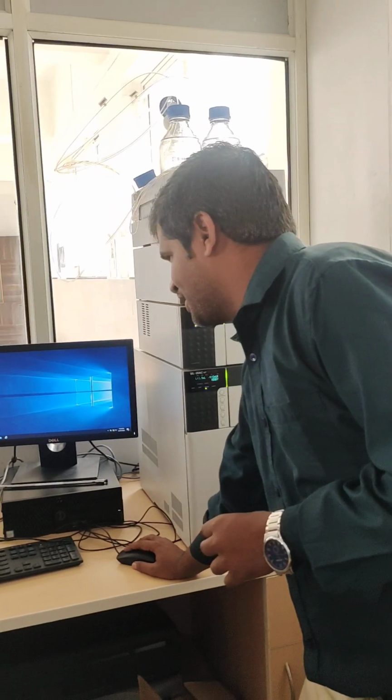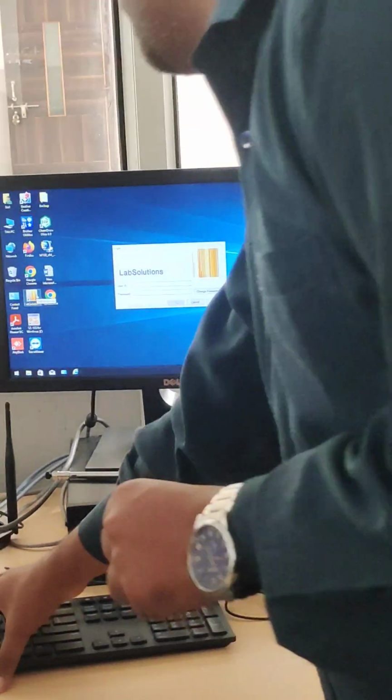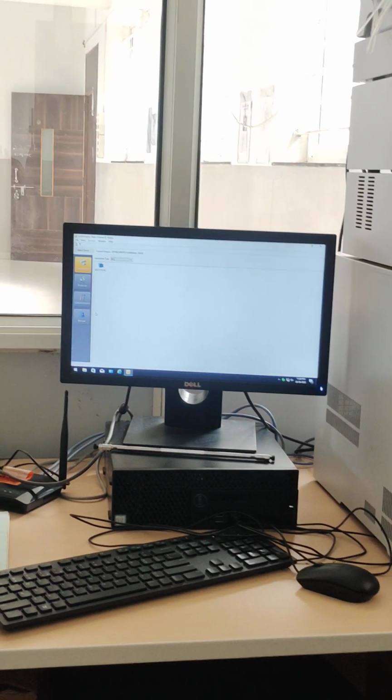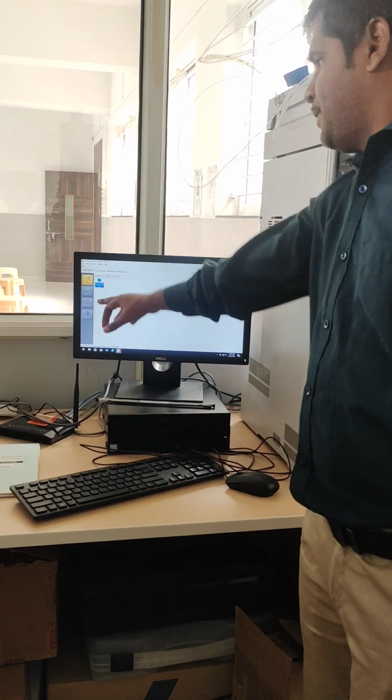Lab Solution software. We'll click on the Lab Solution software and enter your username. I have inserted the username; you don't have the username. So I will click on this particular HPLC.